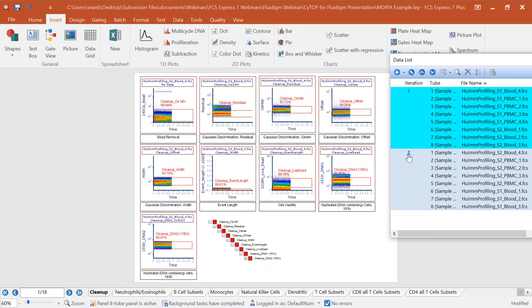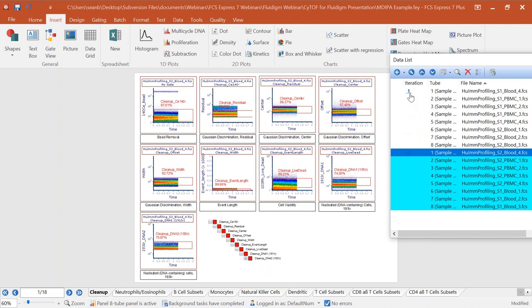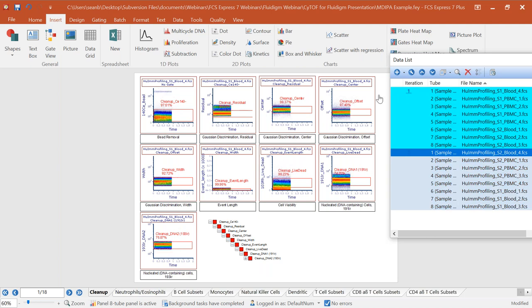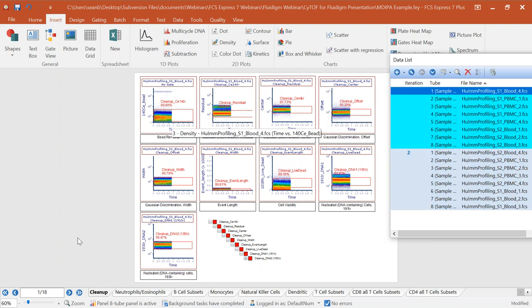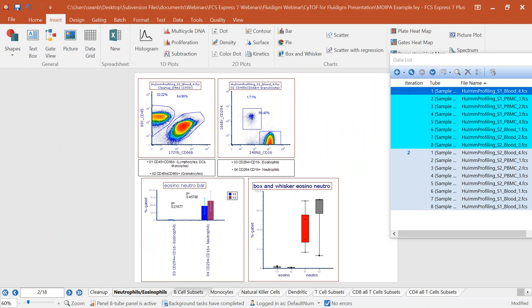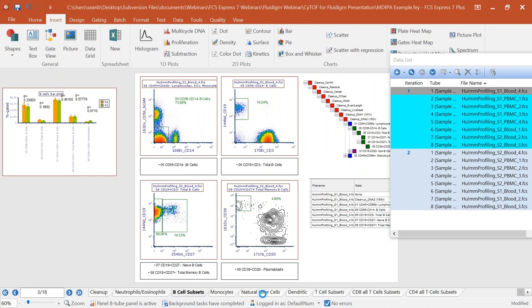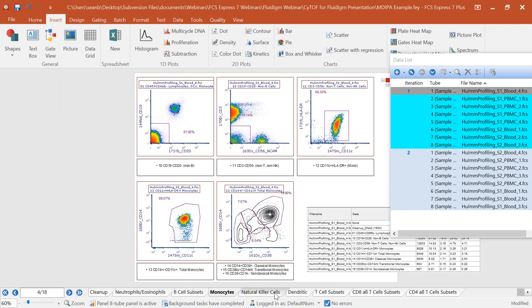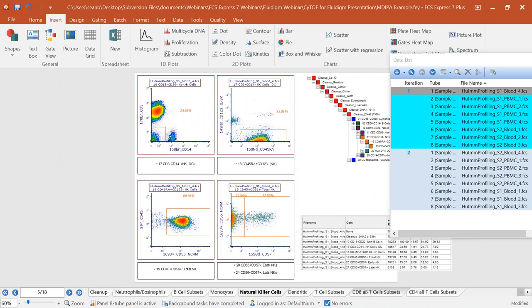I have multiple page tabs, each devoted to a part of my analysis — B-cell subsets, neutrophils, monocytes, NK cells — similar to Microsoft Excel's sheet tabs. I can quickly move between all of these and visualize different subsets. The speed isn't just on data loading: as I make changes to gates in the software, all downstream plots update in real time. Even changing a top-level cleanup gate updates all other gates on that page instantly.